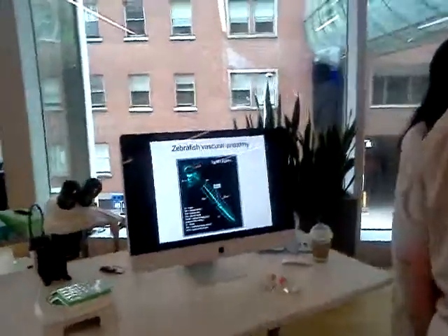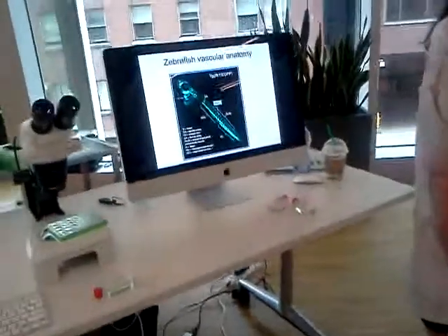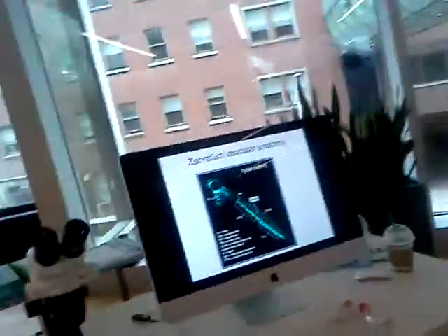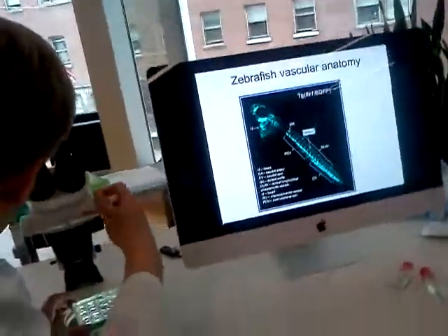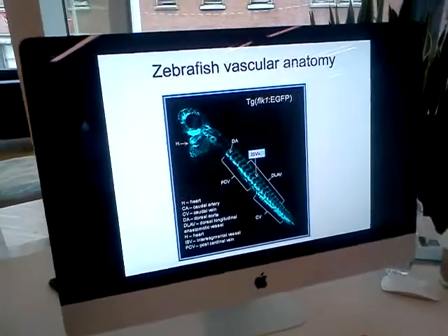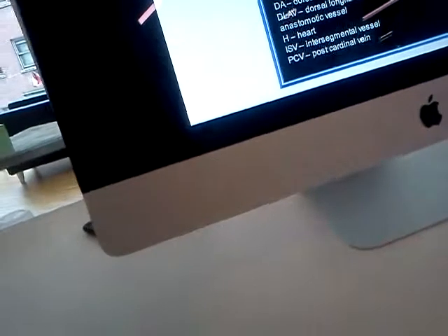So you can see this fish. You can see them under the microscope too. They're very beautiful little things. And would you be looking for work in this kind of thing if you had the option of research? I think so. These are 2-day-old zebrafish. It's a large portion of what career I will go into.